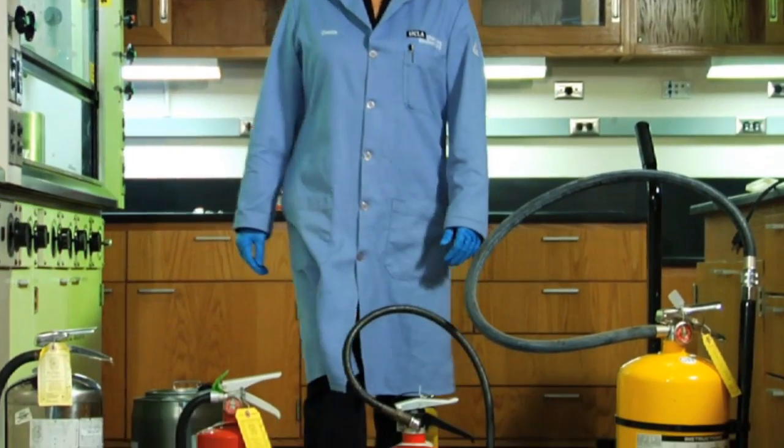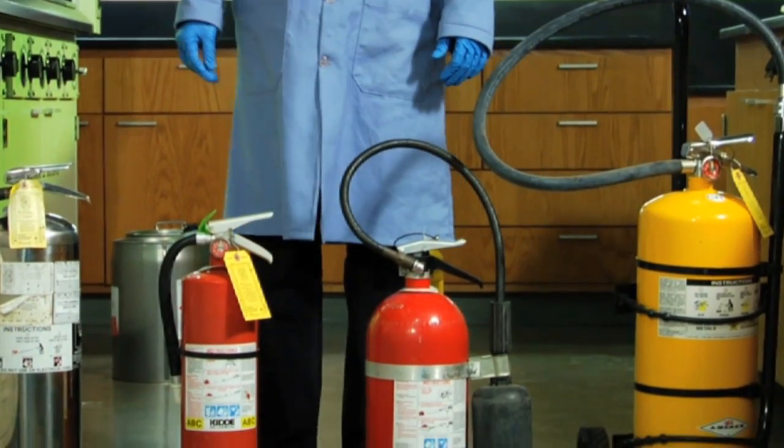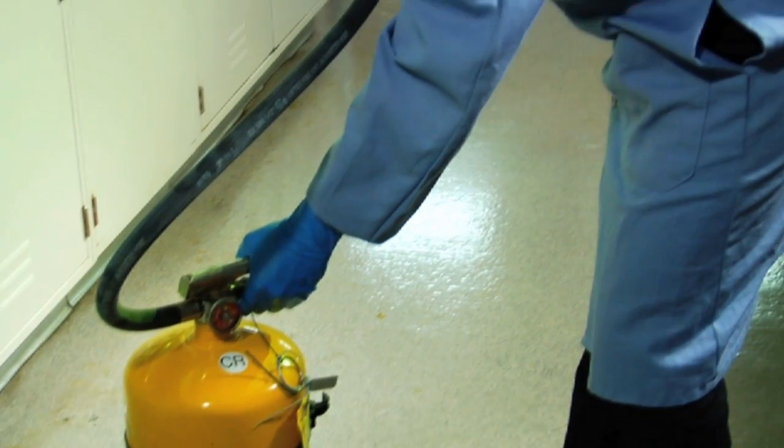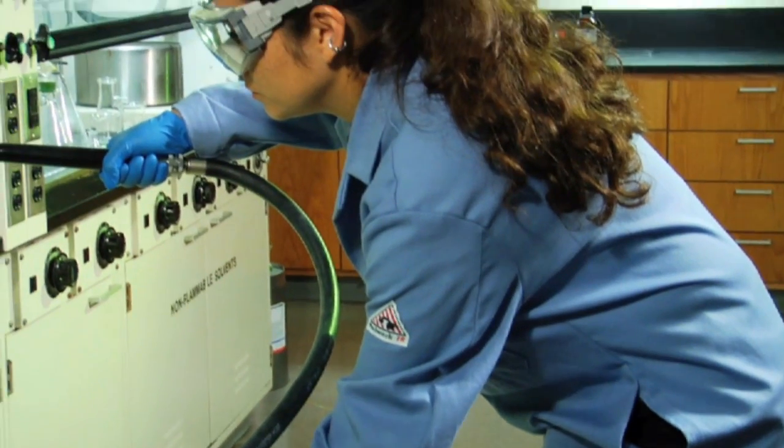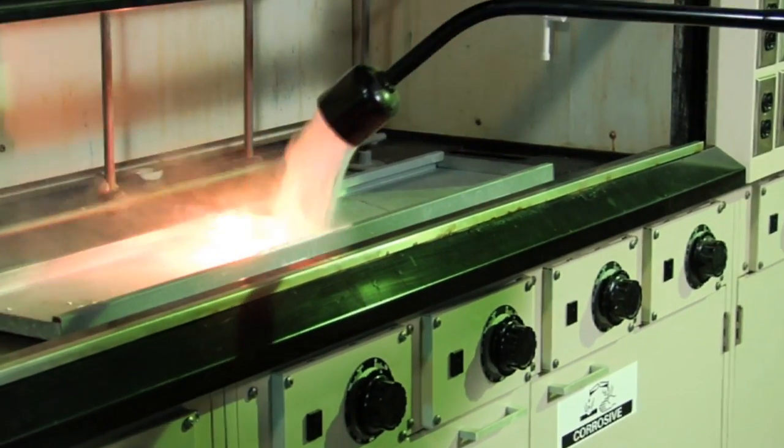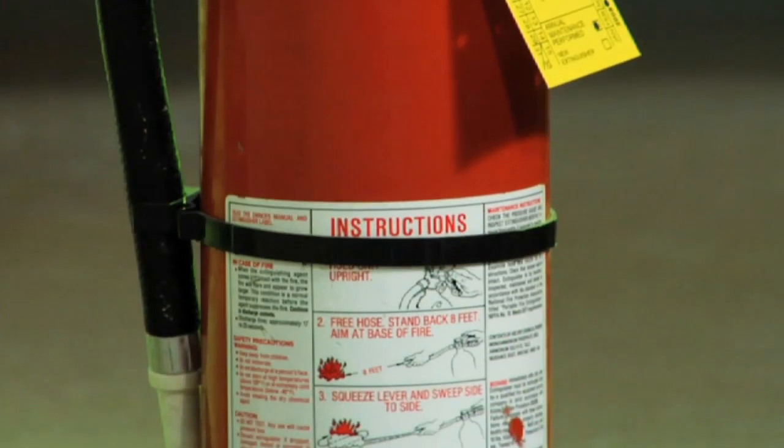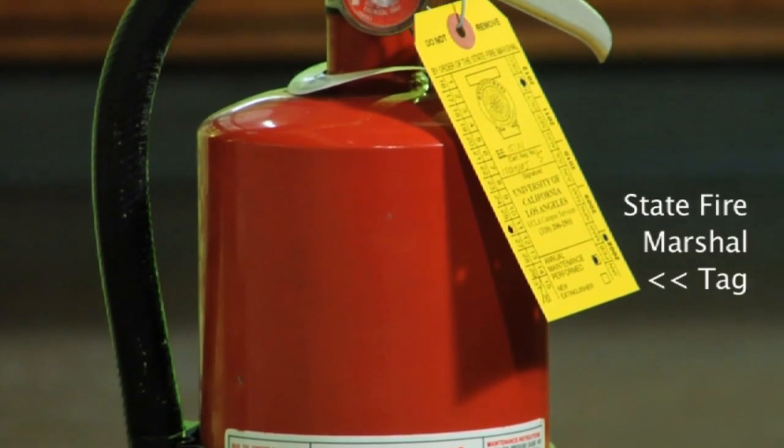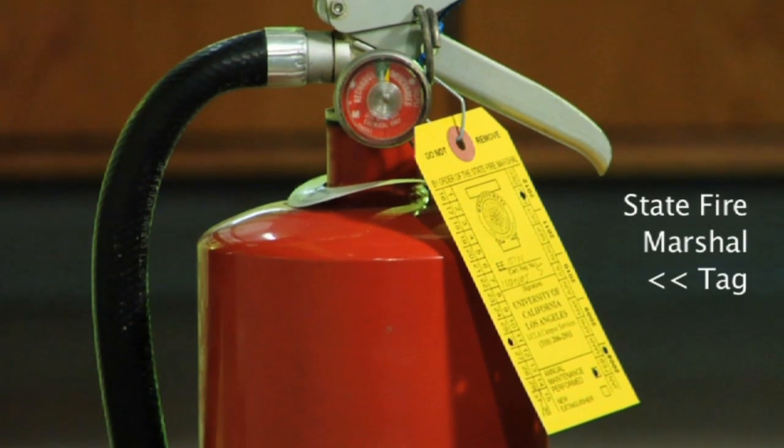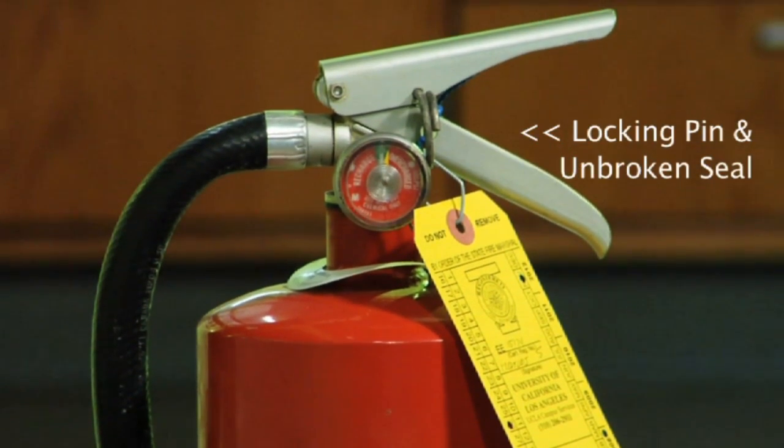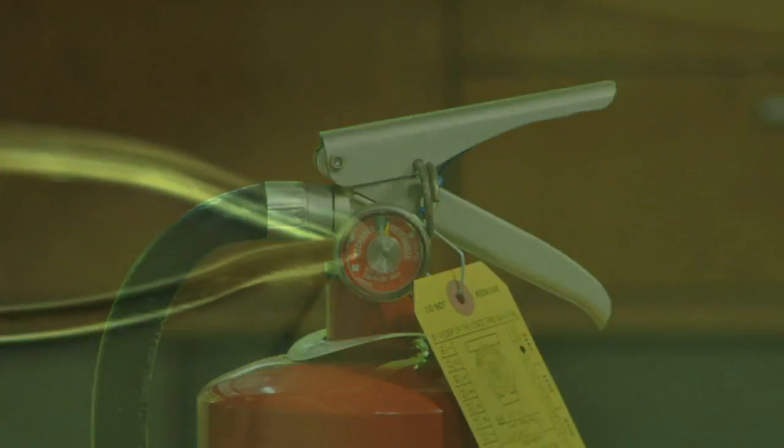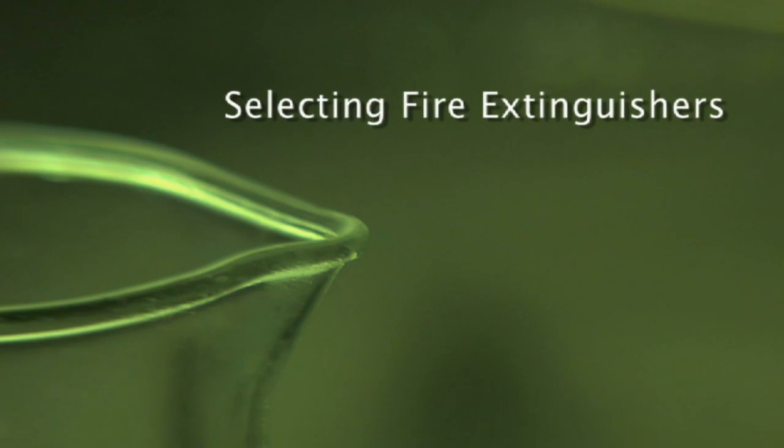Personnel working in lab areas should know how to use and properly identify a fire extinguisher appropriate to the materials being handled. With proper training, you should be able to extinguish a small fire if you feel comfortable doing so. Keep your fire extinguisher accessible and clear of obstructions at all times. A properly maintained fire extinguisher will have an attached State Fire Marshal's tag showing certification date within one year, a locking pin in place and an unbroken seal, and a pressure gauge reading in the green zone.